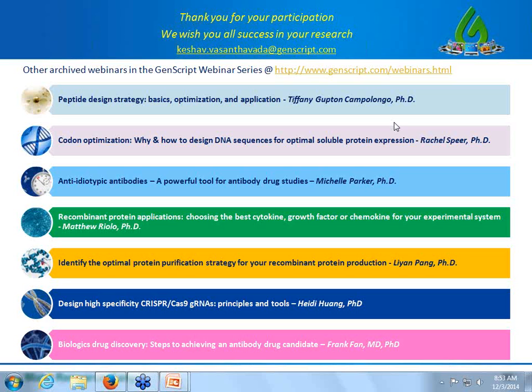But then again, there are protein prediction programs out there that will tell you, for example, in E. coli, the likelihood of your protein being soluble. For example, there is a program that was developed by the University of Oklahoma. This program tells you the probability that your protein will be soluble when you overexpress in E. coli. It's a really nice program that typically uses parameters like approximate charge average and the number of turn forming residues, and incorporates all this into an algorithm, and gives you a customized value.